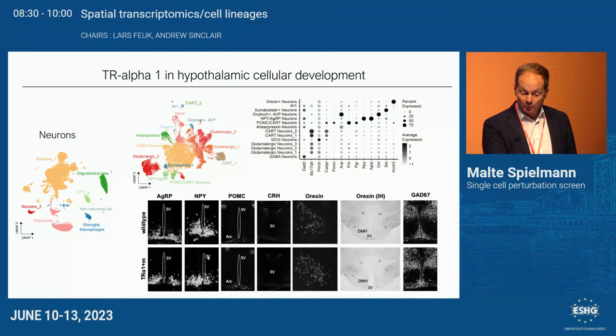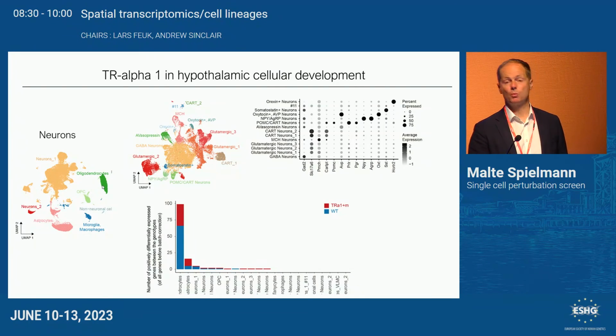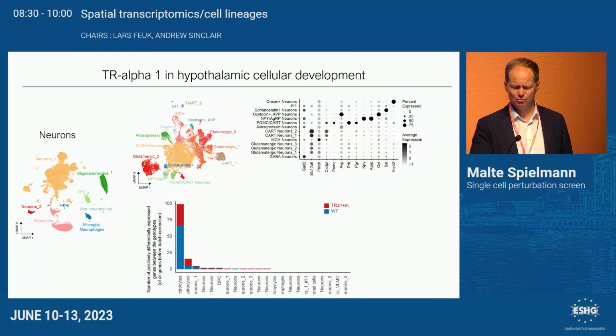And then Varun asked, where are the major differences in terms of differentially expressed genes, because this is the cool thing with RNA sequencing. You can not only get the cell type information, but also what's happening, which genes are expressed. And then it turned out that the oligodendrocytes are actually mainly affected, which is this cell type. So we went back to Jens, the expert, and he said, I don't care about oligodendrocytes. Who does? And we said, well, let's check it out.